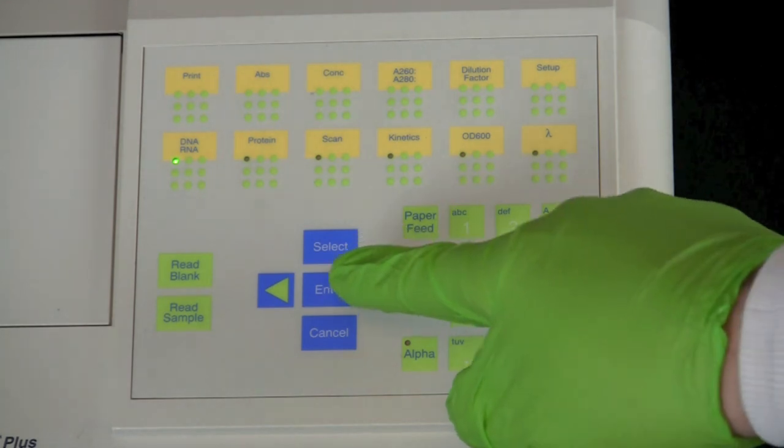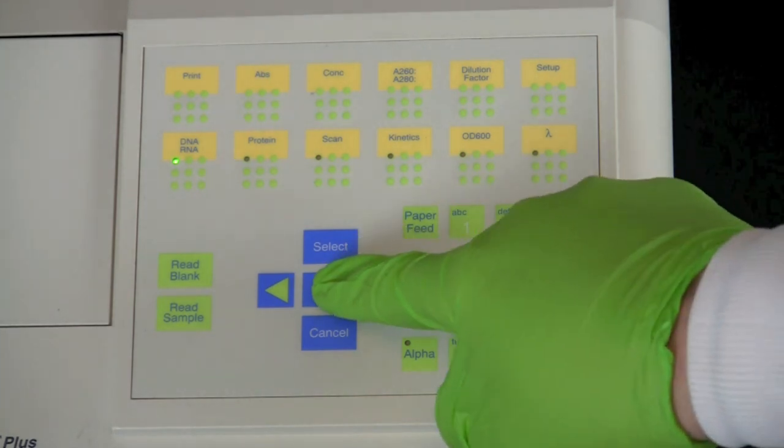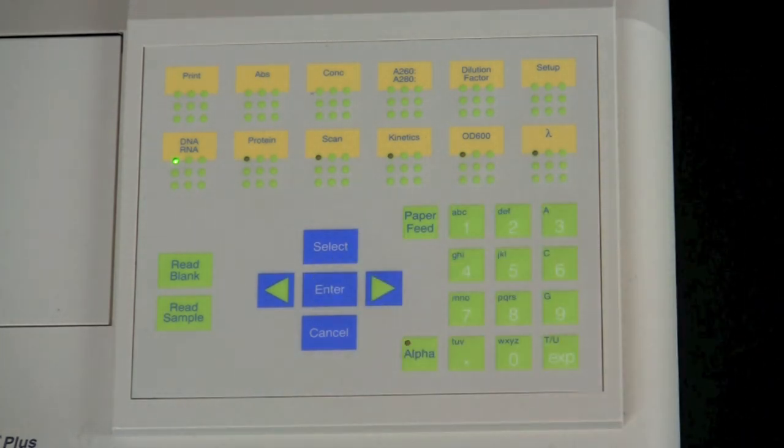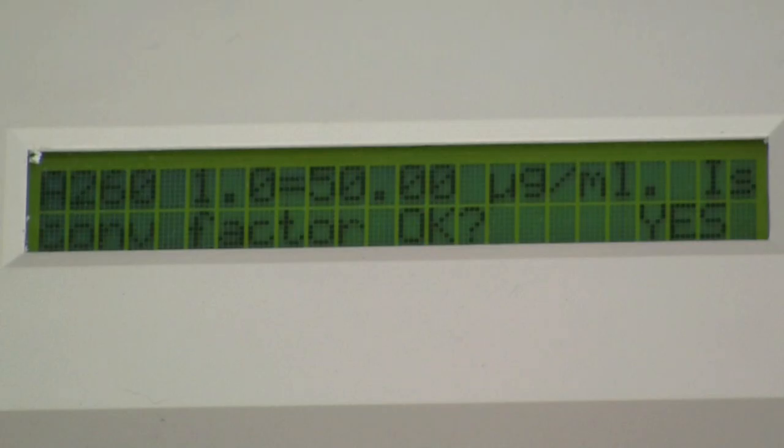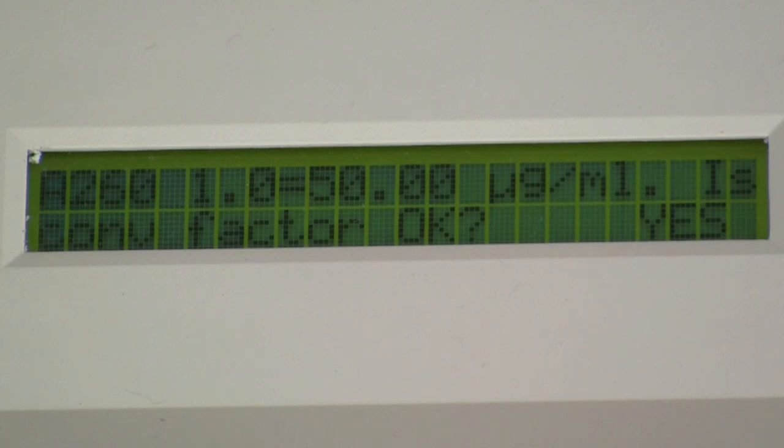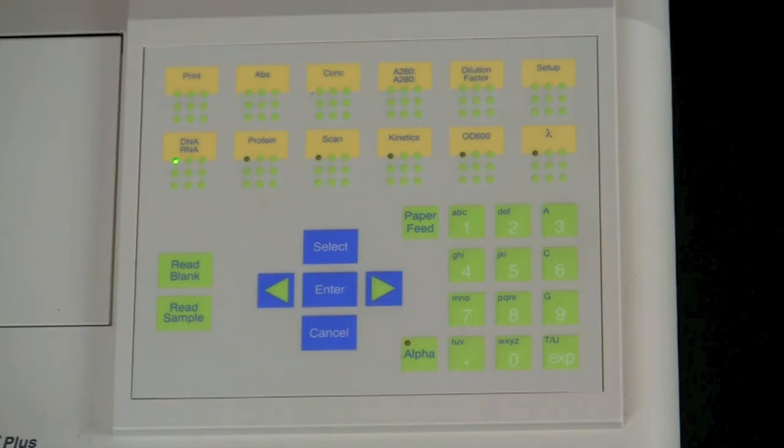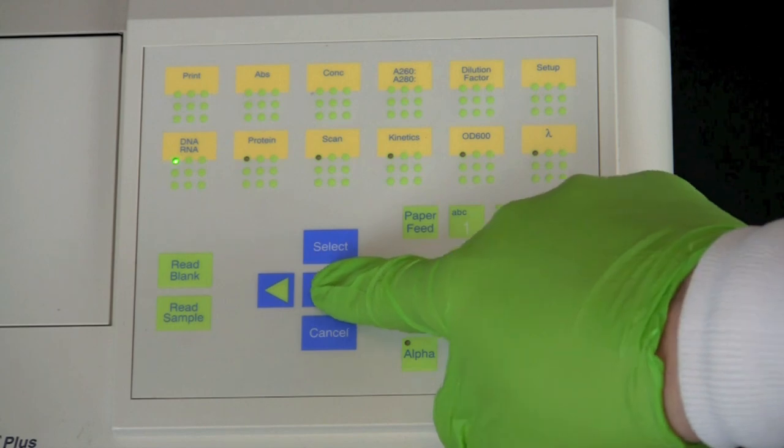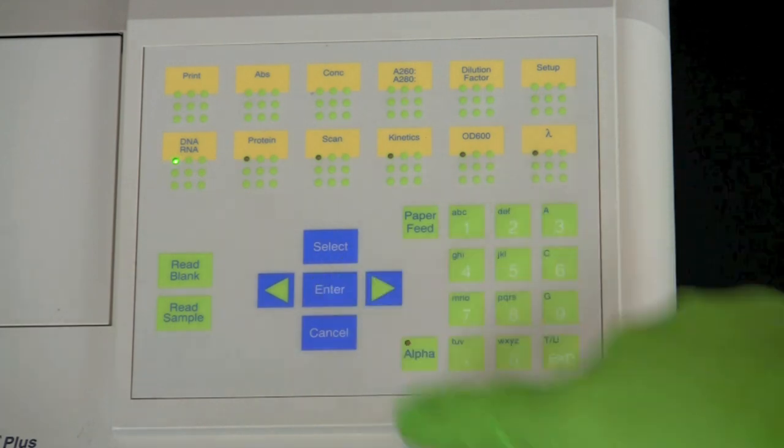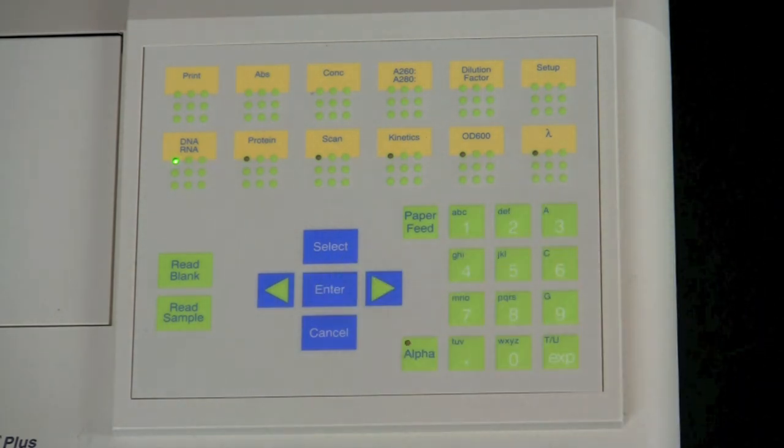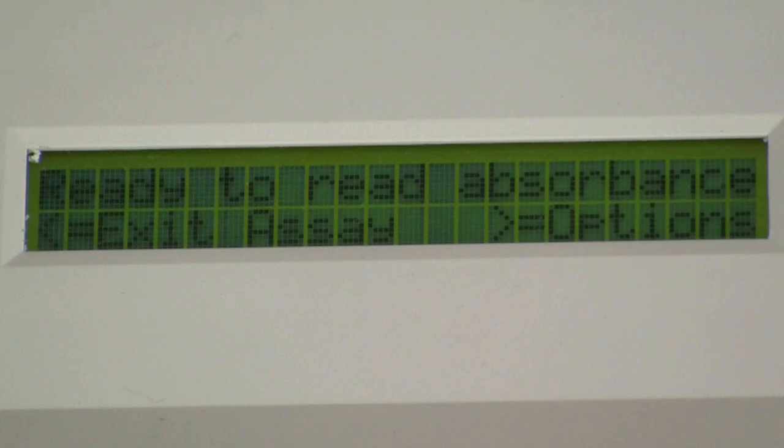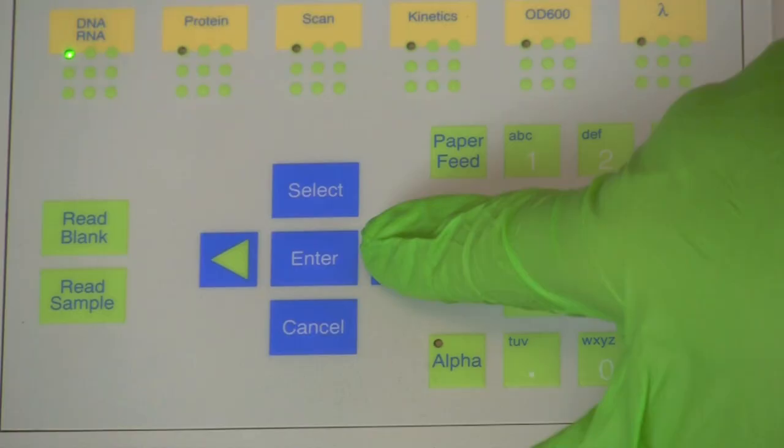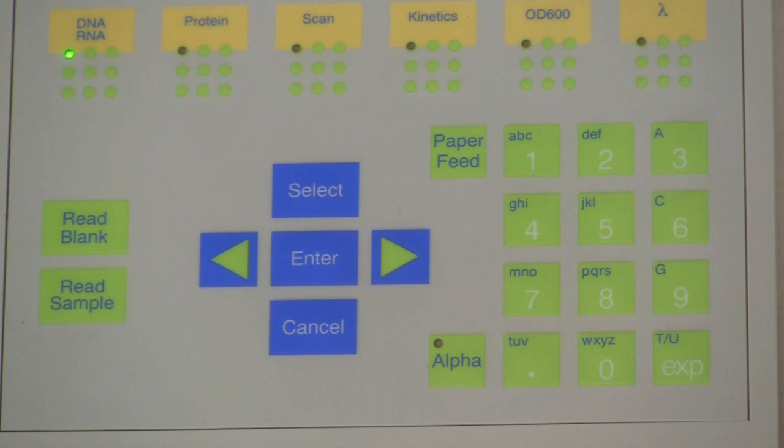Press the enter button. The display screen should now show that you are ready to read absorbance. Press the right arrow button.